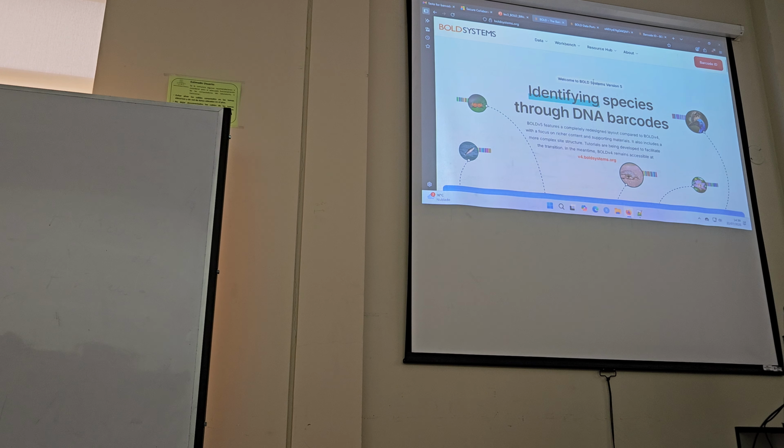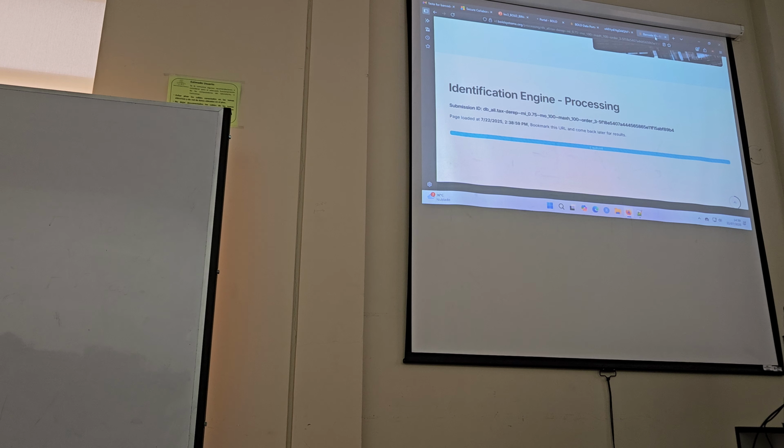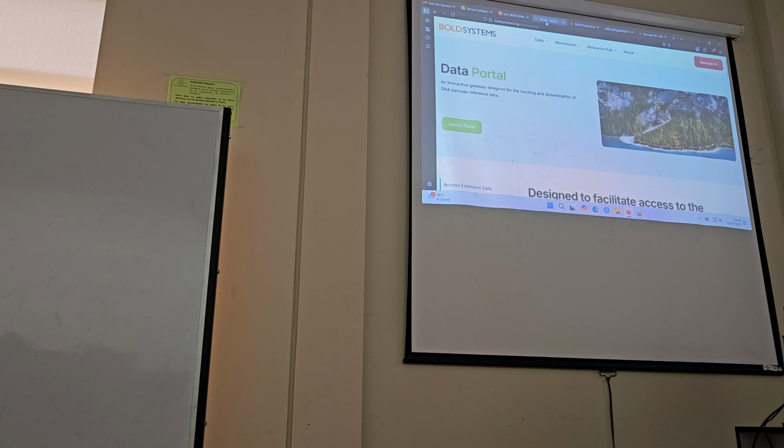Okay, let's try this. So, BOLD data portal. Everyone, click that. We might be having some computer problems back at the University of Guelph, so we'll see. Okay. Everyone's here? BOLD data portal. You go launch portal.